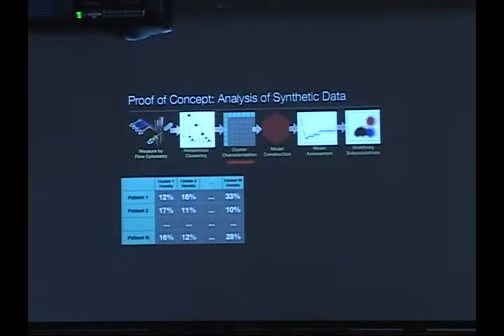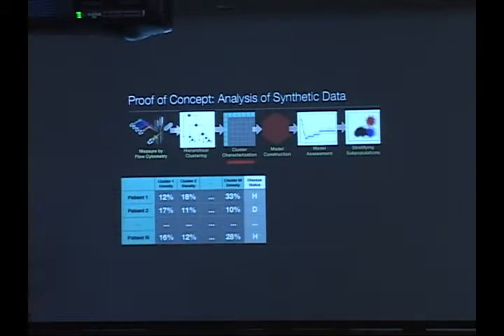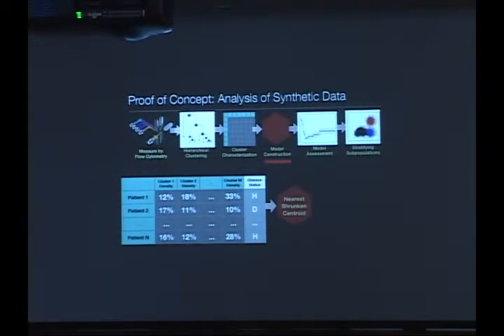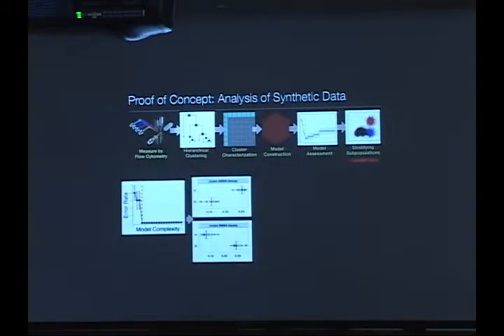After that, we'll take this matrix of cluster properties. We know which of these patients are healthy and diseased. We know that already based on our external experimental information, and we'll pass it into this regression algorithm. And we ask the regression algorithm to find us the subsets of these clusters that differ between our healthy and our diseased patients. And so the model does some internal evaluation of the value of each of the features, how predictive are they, and what it spits out is a set of features.